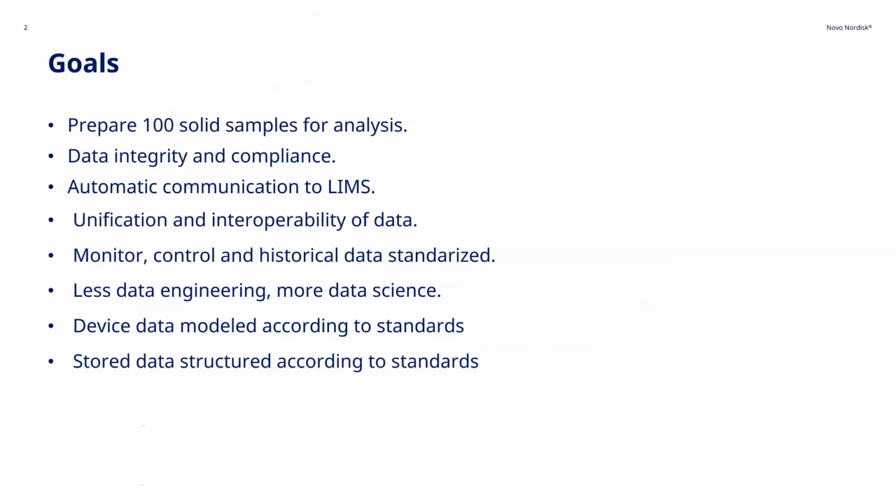We also wanted all the data to be somehow unified from all the instruments and devices. When I say all the data, I mean at least monitor, control, and audit trail, and historical data.